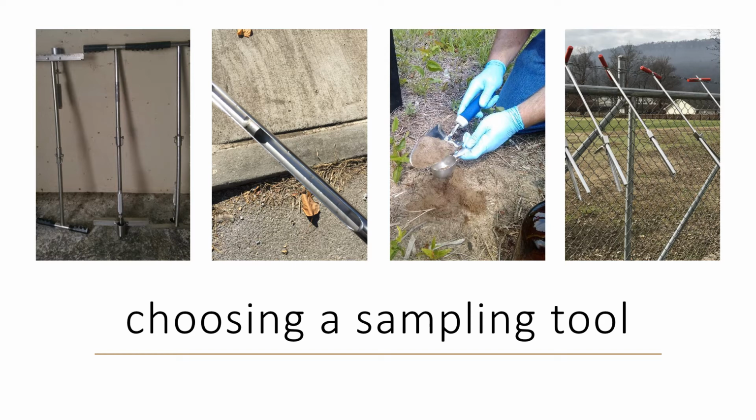The third picture from the left shows a simple hand trowel and stainless steel scoop. This was used at a site after it was found that the soil was too sandy to stay inside of the original sampling tools that were selected for the project. The sample simply was released from the tool as soon as it was pulled from the soil, and we were unable to collect any sample increments. By using the hand trowel and the scoop, we were able to make sure that we had same size increments throughout the sampling area.